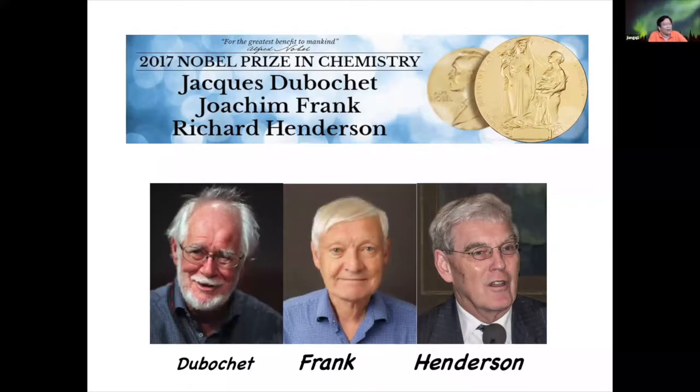And then during the past almost 60 years, the technologies advanced such that single particle cryo-EM has been able to deliver near atomic or atomic resolution structures. Because of this major advancement, three pioneers in the field were awarded the Nobel Prize in 2017.